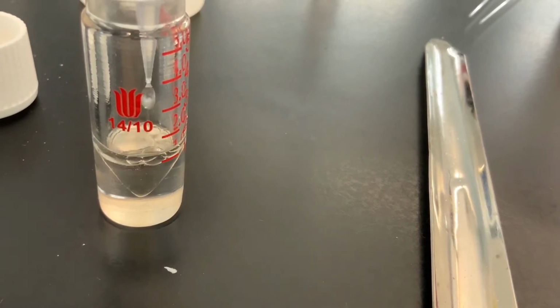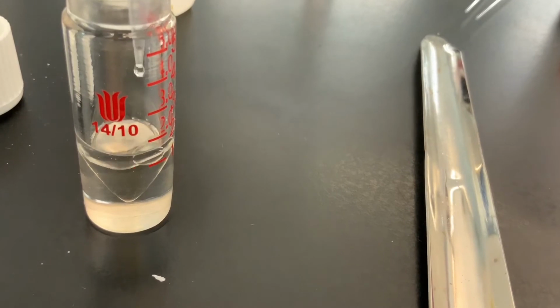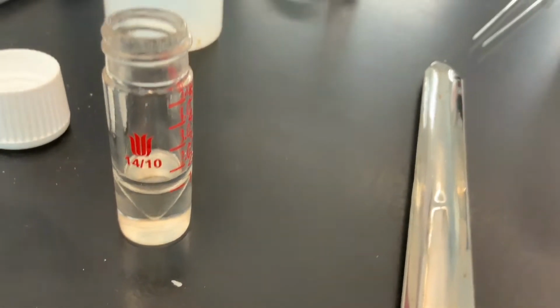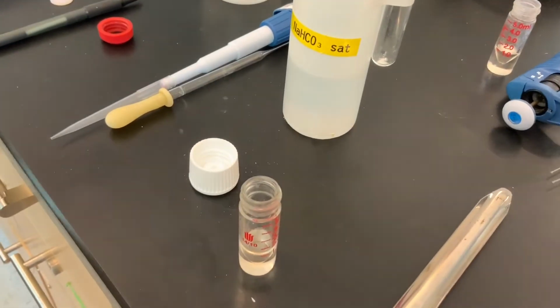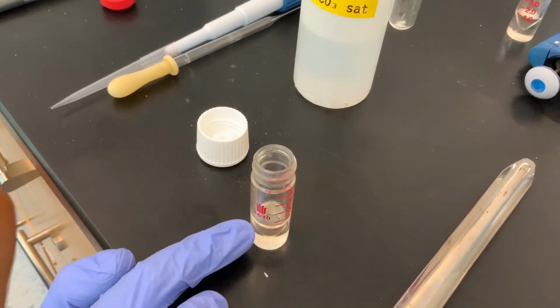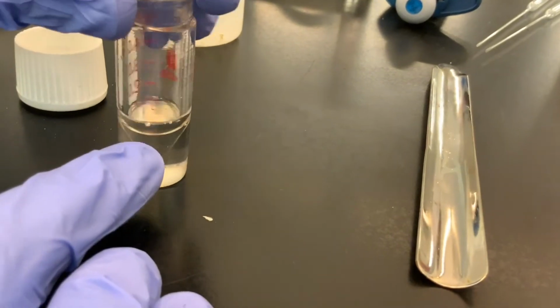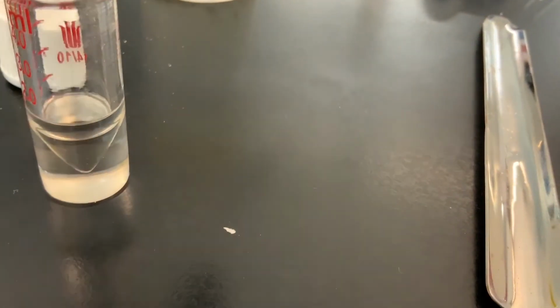It doesn't immediately stay on the top because it's saturated with sodium bicarbonate, so the density isn't 1 anymore. And so it didn't float immediately. Also, we can see that we haven't even shaken it yet, and there are some bubbles forming. Those bubbles are the carbonic acid being formed and already decomposing into carbon dioxide gas.